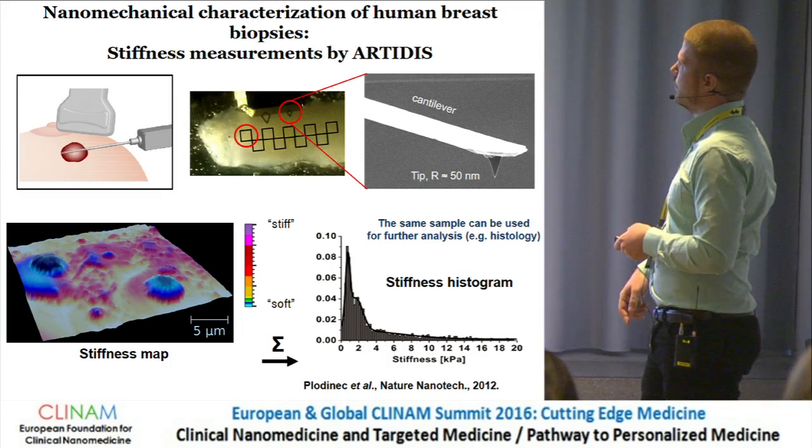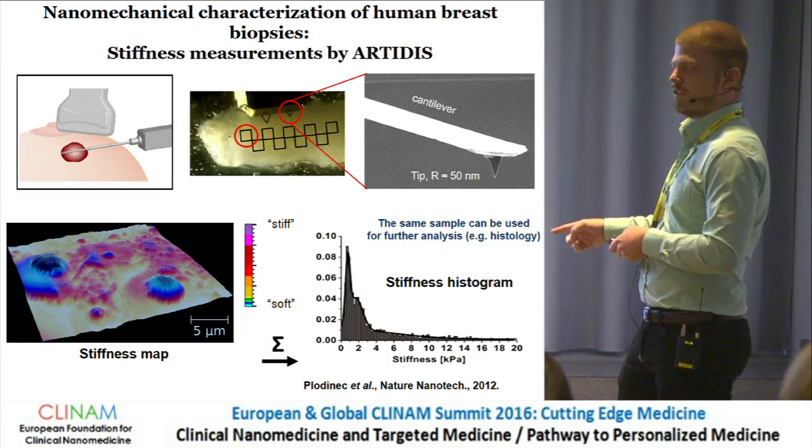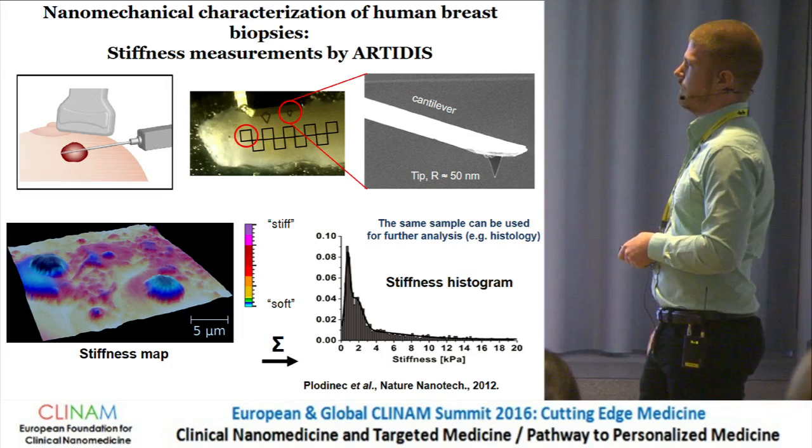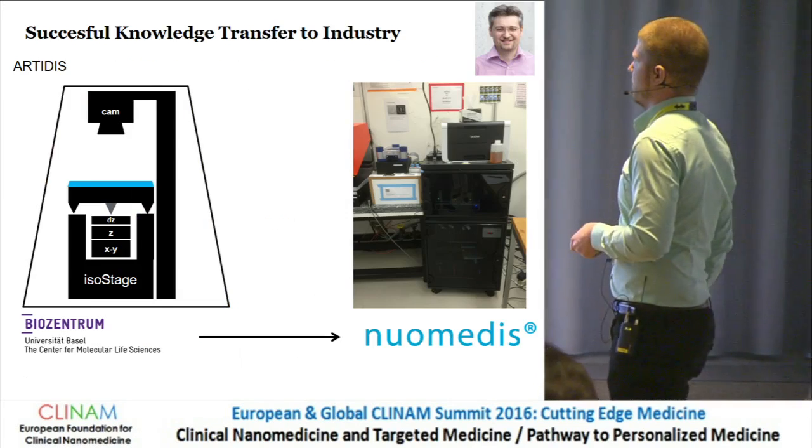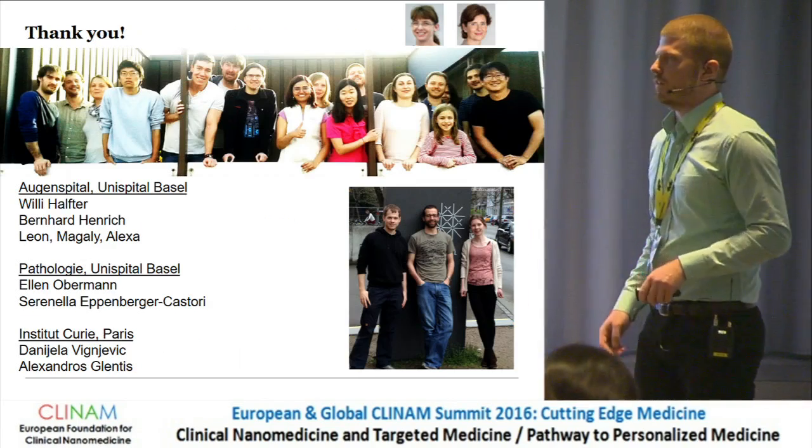And the cool thing is that AFM, same technology, you can also use to measure on the tissue level. But Marco, in his last talk in this session, will cover more of this. Thank you, everybody.